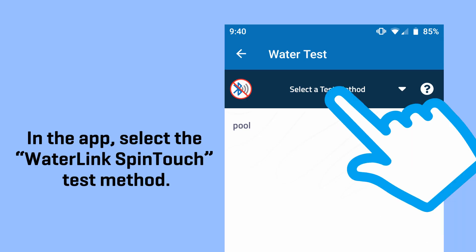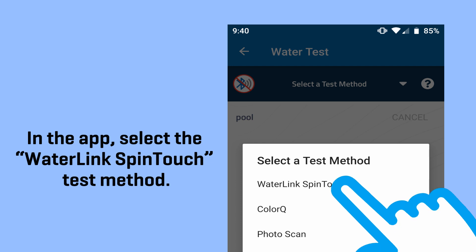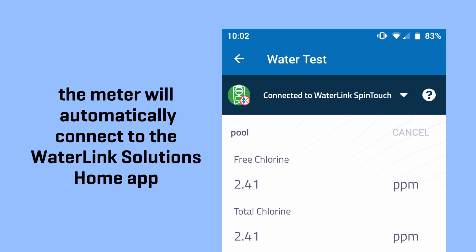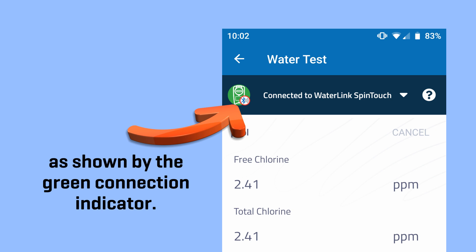In the app, select the WaterLink SpinTouch test method. Once the test is finished and results are displayed on the touch screen, the meter will automatically connect to the WaterLink Solutions Home app, as shown by the green connection indicator.